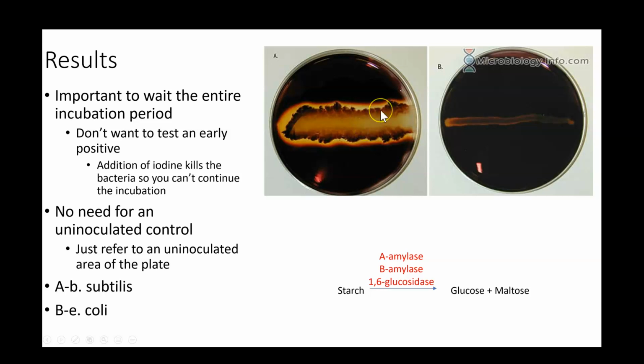So the starch test is actually one of the interesting tests, or an exception, I should say, because it's one of the few tests where you can't read an early positive. If you think about all of the tests in the biochemical testing, as soon as your results are positive, you can be like, well, there you go, it's positive, no problem. You never want to read an early negative because you want to give it time to change. But if it's a positive, then great, you can read it.